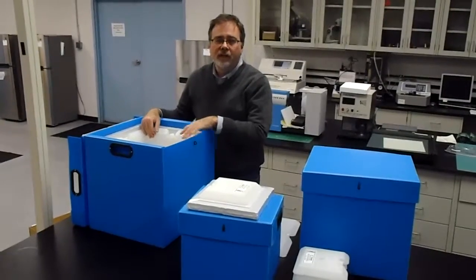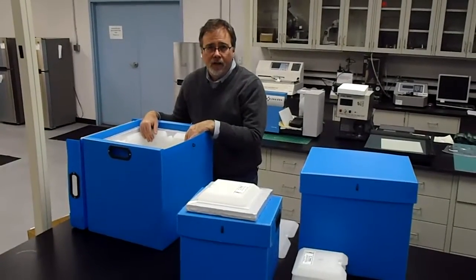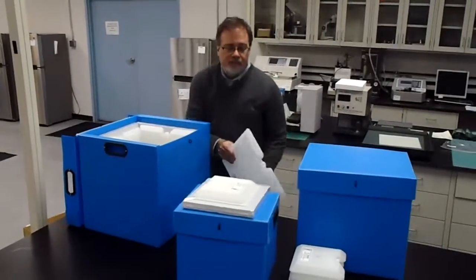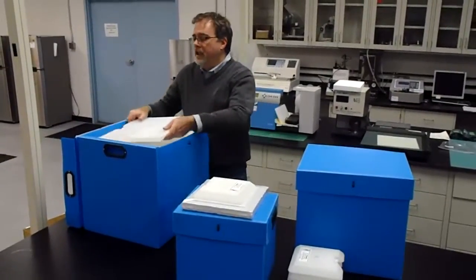Once the side panels have been installed, it's now ready to accept the payload. When the payload has been installed, simply place the last phase change panel on top of the cube.